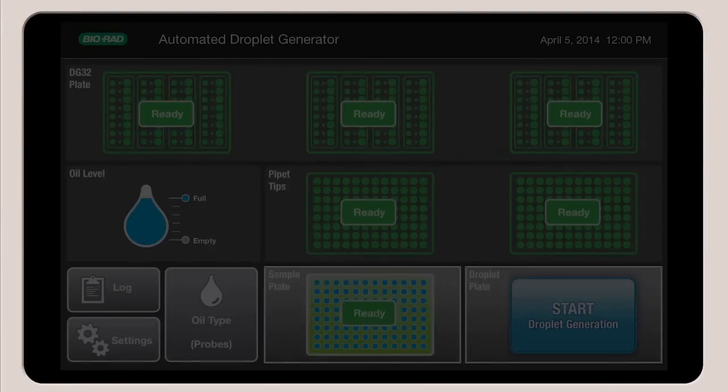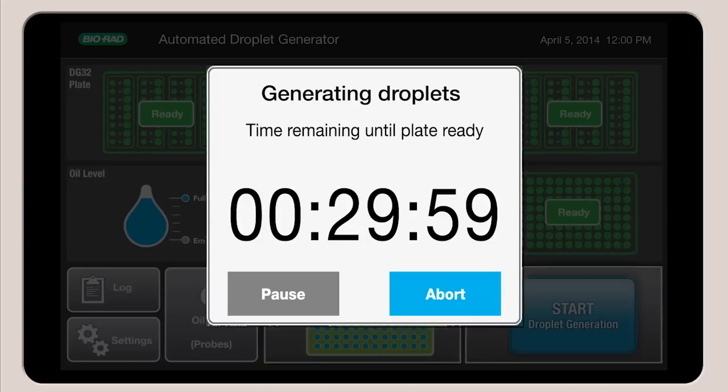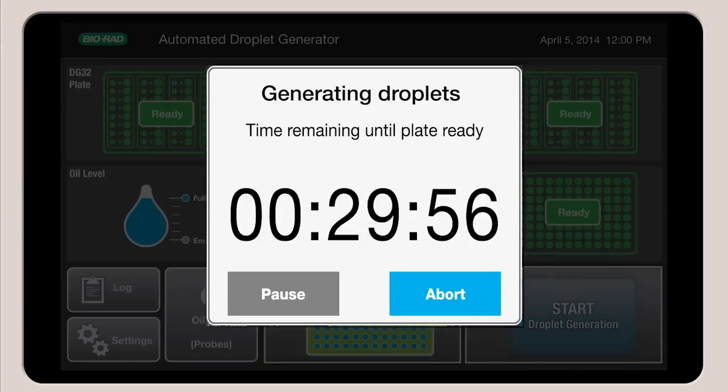After initialization, a countdown timer displays the time remaining until droplet generation is complete.